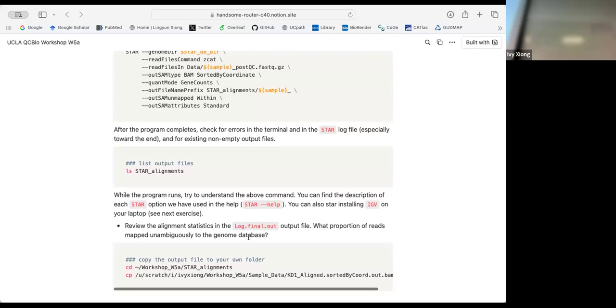I recommended going through the fastp filtering step, or you can copy the zip file from the threshold. So I have that. Now you want to fix the input, the output from fastp, right? You can either run that again or you can copy. I'd rather try to figure out why my code doesn't work.